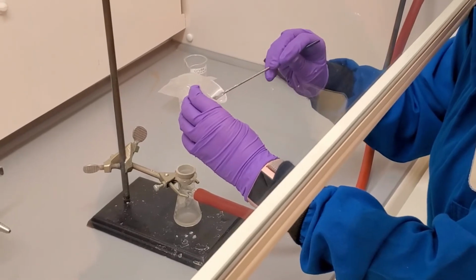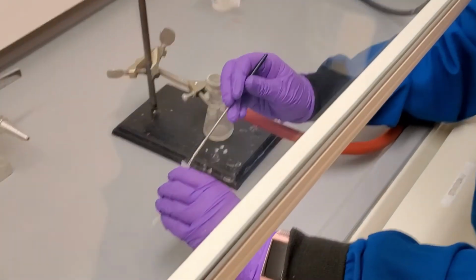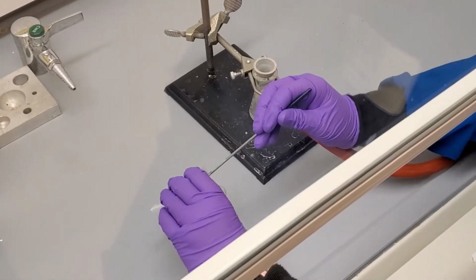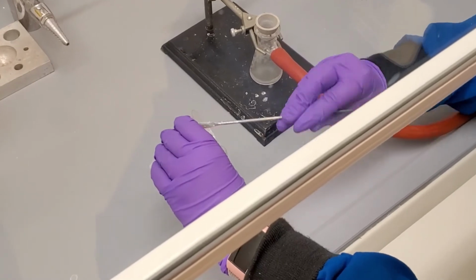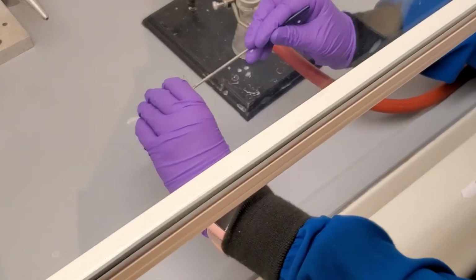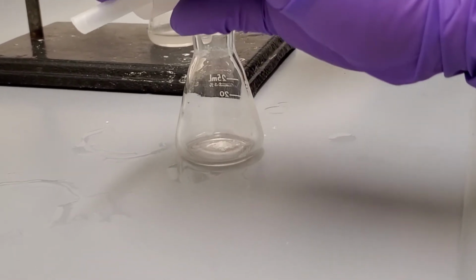In order to remove the water, we will redissolve the product in diethyl ether and dry with sodium sulfate. We turn off the vacuum and transfer the product to a clean, dry Erlenmeyer flask. Carefully scrape as much of the crystals from the Hirsch funnel as you can.